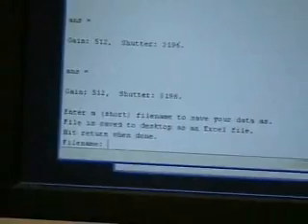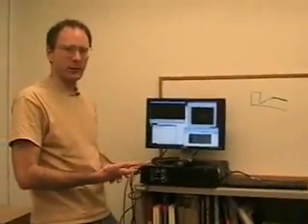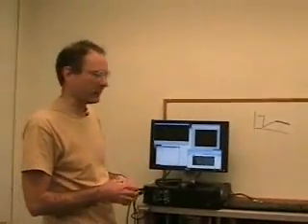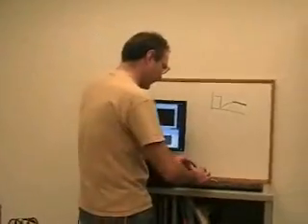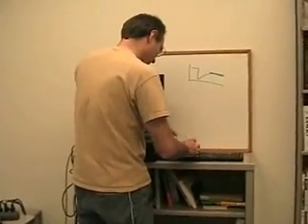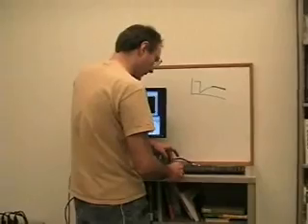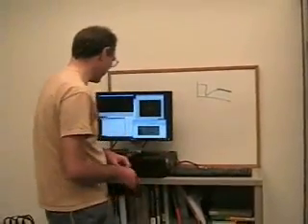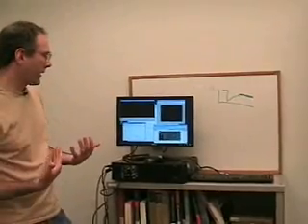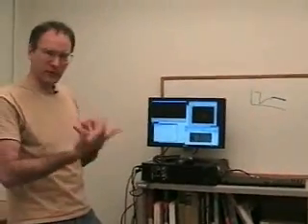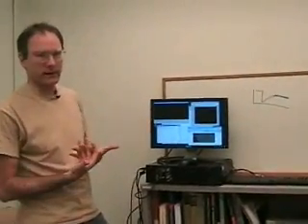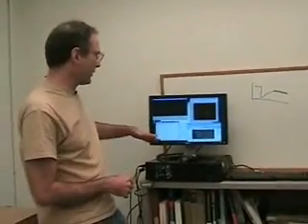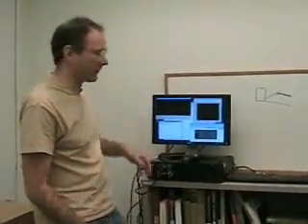So you'll notice the shutter's gone in the live image, but I'm left here with the spot that I had before because I have not updated that image. And furthermore, in the command window, I now have a new set of instructions. And it's asking me for a file name to save my data as. And you want to make sure that you pick a legal file name. Don't put a lot of strange characters in here because otherwise you'll do the whole experiment. At the end, it will crash because it can't handle a strange file name. So I'm just going to put my name, Bob Smith. I might put for PCT for a 4% sample. And you can choose whatever you want, but don't put the actual percent sign in. If you want to say percent, put PCT. And you can always rename this later. Pick something simple. You know what it is. You know which sample you're using. Hit Enter.